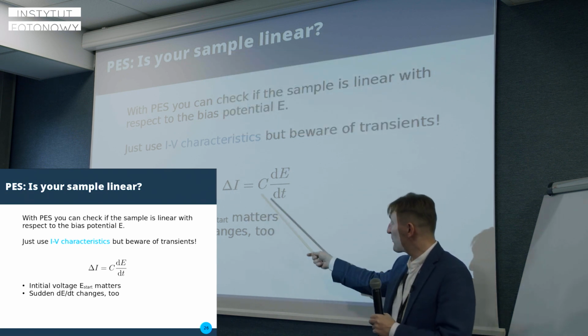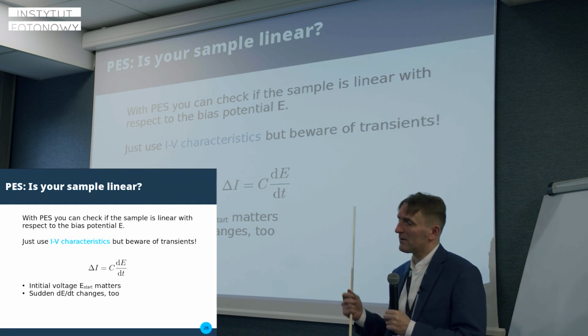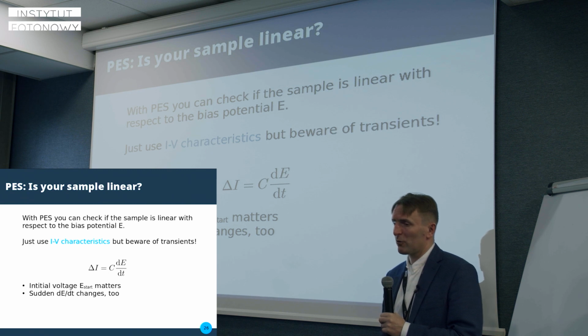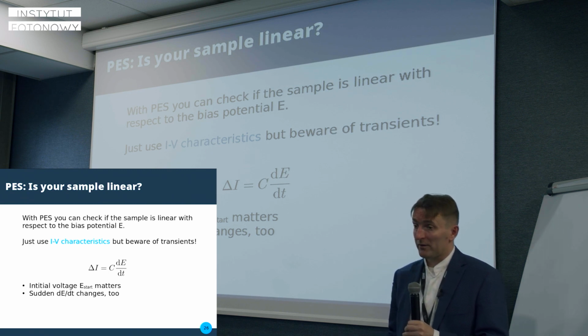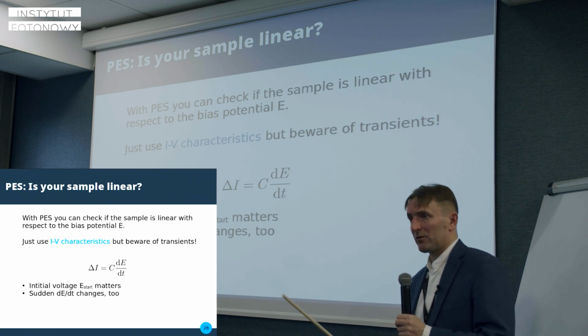So whenever you have this capacitance, you will have those spikes, and then don't worry about them. They do not mean that your sample is nonlinear. That means that something happened to your input.